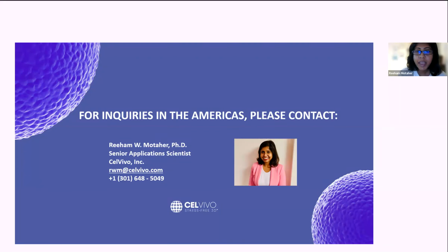Perfect. And another question: is there a specific media that must be used to grow cells in the clinostar? And if I wanted to use a thickening agent such as cellulose, would I be able to add that to the media? So again, two questions in one.